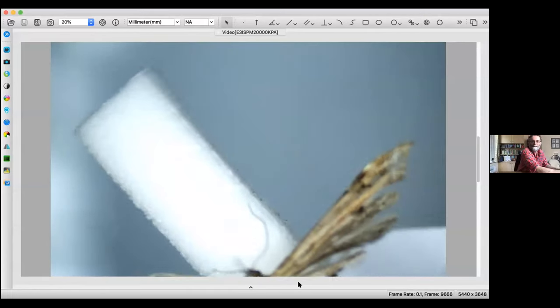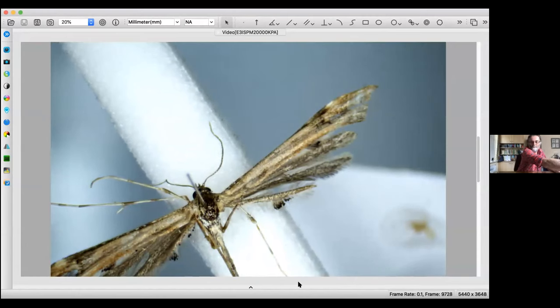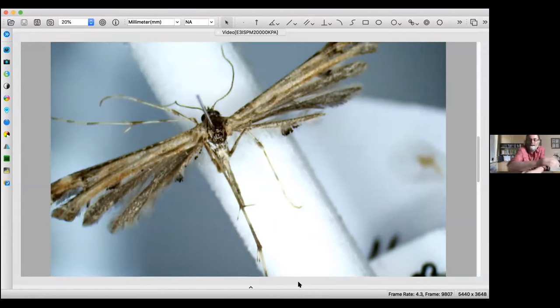I'm not expecting everybody to be able to set the specimen, but if we just go through the process you'll understand why it's so important to present the specimen nicely. I've put this specimen under the microscope, and what you can see is that I've got a plume moth. It's very clearly one of just two species of plume moth — the brindled plume or the beautiful plume — and this one is actually a beautiful plume.